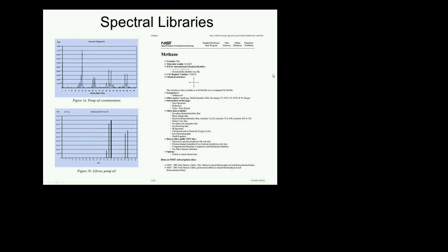And this brings me to this slide, which is, where do you go and get spectra? My main source of spectra is the NIST WebBook, and the NIST WebBook is great. You can literally enter the mass of a peak and it will suggest species for it. Or if you think you know what species it is, you can type the formula. It will give you the mass spectrum and you can compare. So here's a good example.